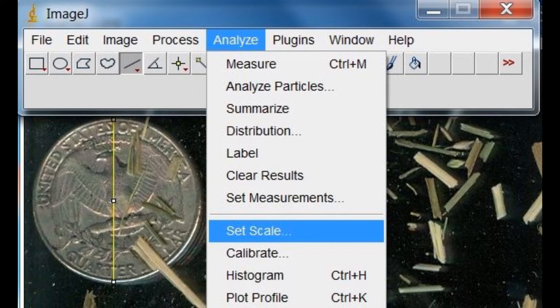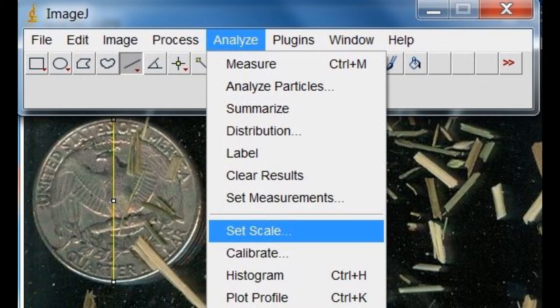To properly measure the size of the particles, a scale for the image in the program must be set. This is done by zooming in on the quarter by clicking Image, then Zoom. Once the quarter takes up the majority of the screen, select the Straight Line feature and draw the line from one side of the quarter to the other.